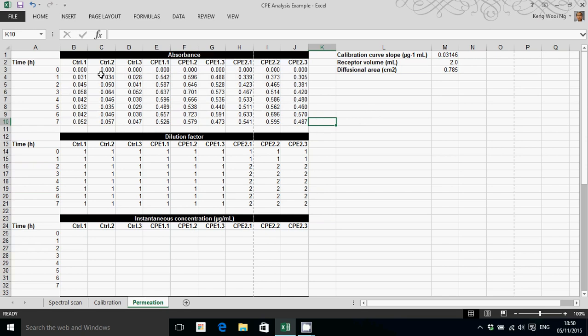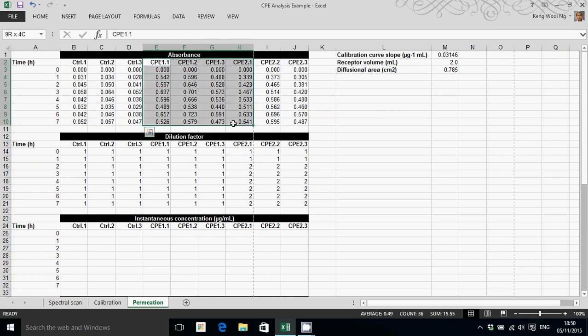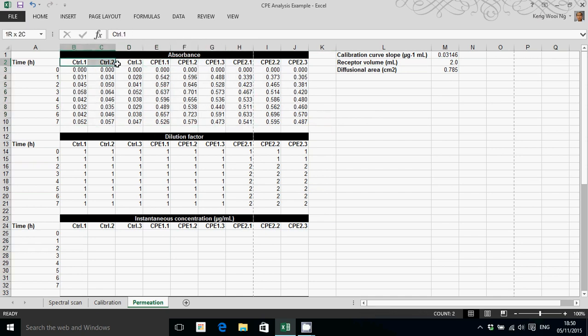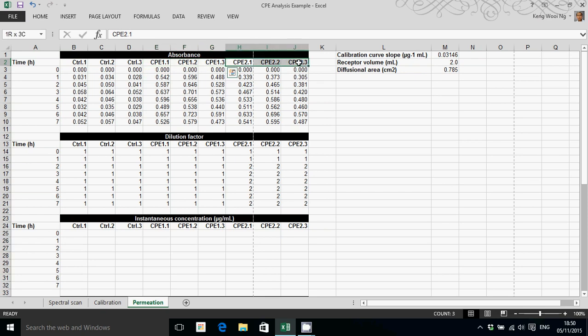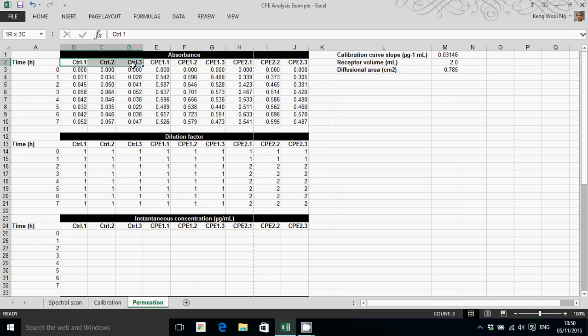The data are entered into these columns. In my experiment, I've got three replicates for each treatment. I've got three treatments altogether. The treatments are control, CPE1 and CPE2. For each treatment, I've got three replicates. These are denoted by the number that follows the decimal point in that label.